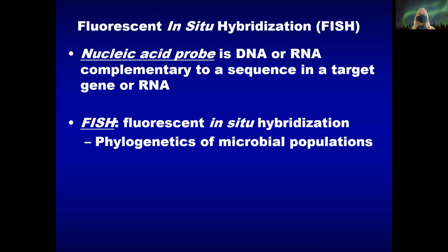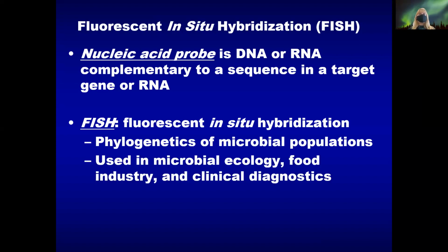So FISH is a pretty powerful technique because you can really ask a lot of questions using it. It is a favorite tool of a lot of scientists in the microbial ecology realm, but also in very applied areas like the food industry or looking for certain pathogens in the clinical microbiology world.